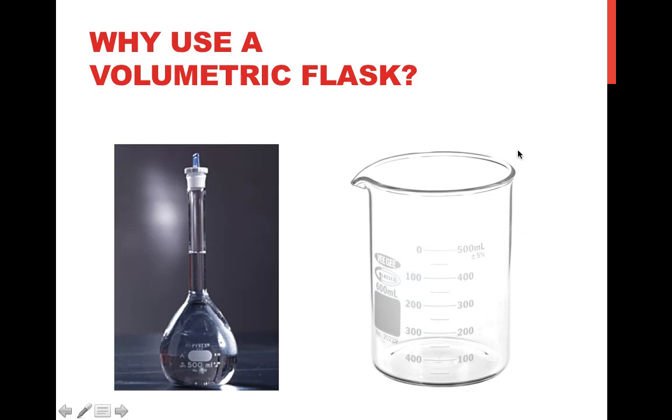Okay. The other equipment that we would have would be a beaker. Now, take a moment and think, why do you think it'll be a lot more accurate in terms of the volume of the solution that we have if we use a volumetric flask versus a beaker? If you notice the diameter of these flasks, you'll notice that the diameter on a beaker is significantly larger than the diameter over here. And what we're going to find is on a volumetric flask, there's going to be a marker that says this is the specific volume.